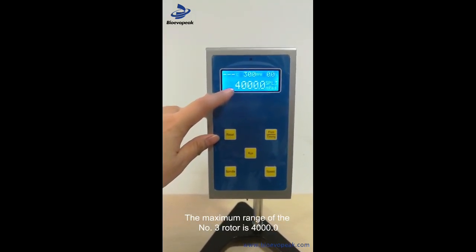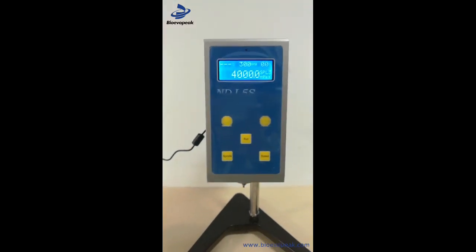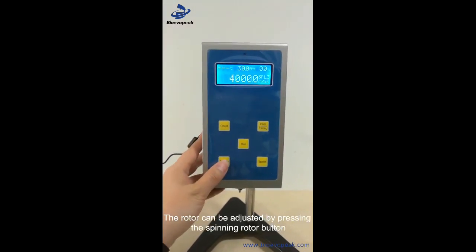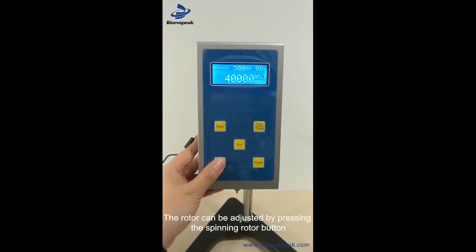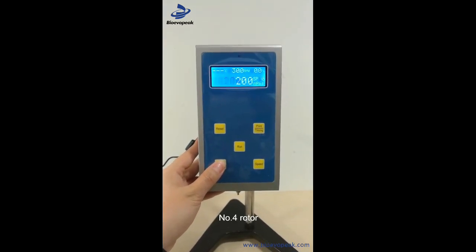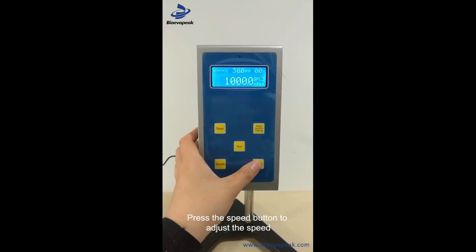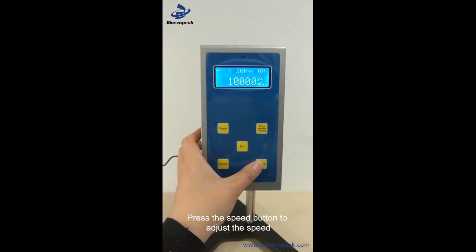SPL3是三号转，最大量程是4000。我们可以按转子键调整转子：先4号转、0号转、1号转、2号转。按转速键可以调整速度。(SPL3 is rotor #3, maximum capacity is 4000. You can press the rotor key to select rotors: rotor 4, 0, 1, 2. Press the speed key to adjust the RPM.)